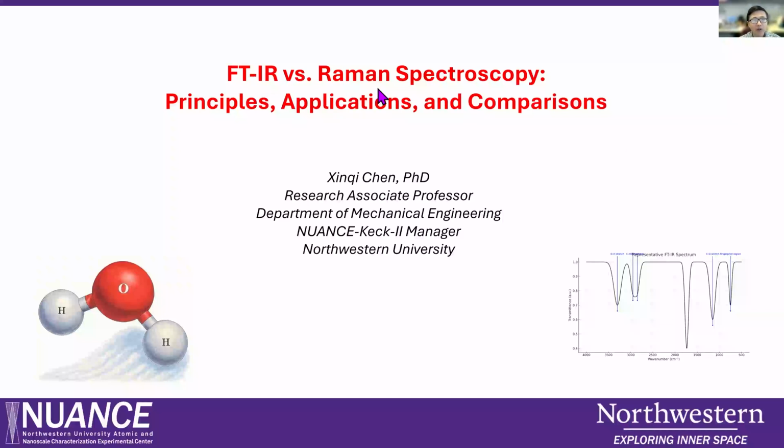So this FTIR and Raman technique is most commonly used in labs for chemistry analysis. Some students maybe know how to collect spectra for the analysis data but still struggle and do not fully understand the technique. Today, I want to talk about the principle and hope to help you understand what this technique is, and what information they can get.